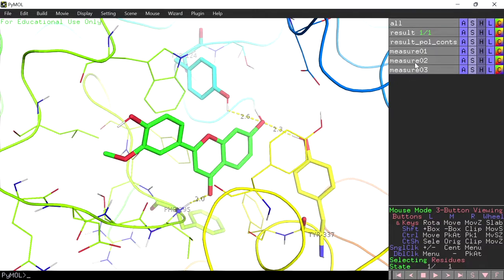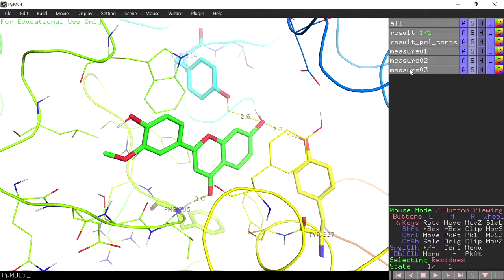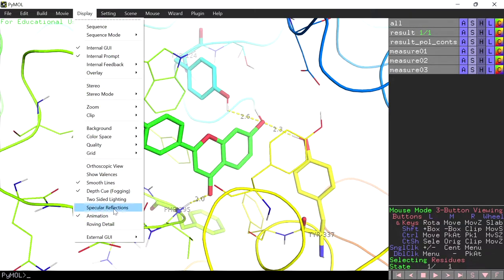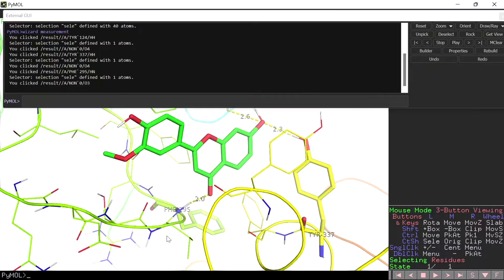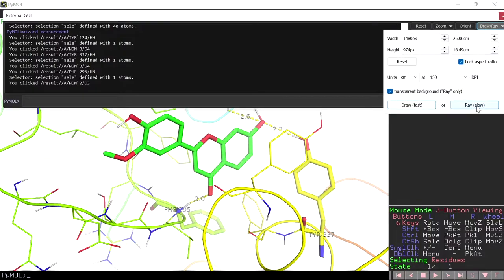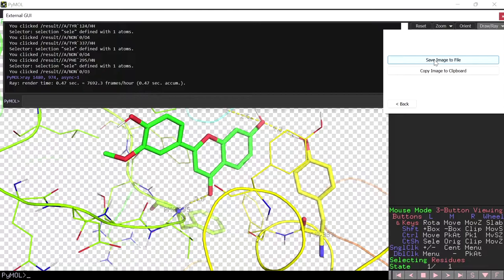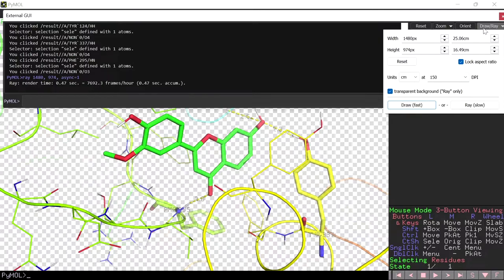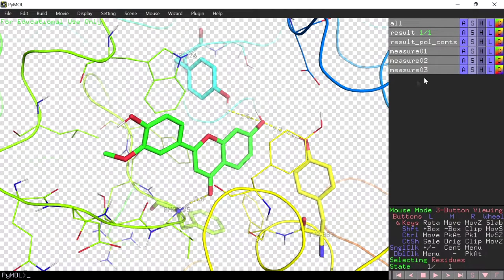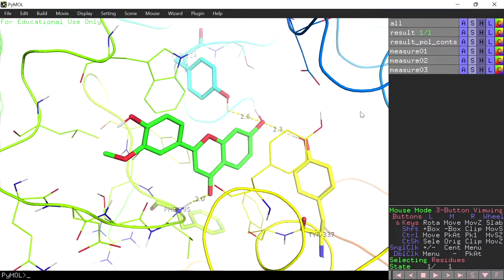As you go along you will find different objects in the object control panel — these are the measurement objects and the interaction objects. To save the view, go to the draw or ray button and ray trace to get a very good quality image, then save the image to a file.